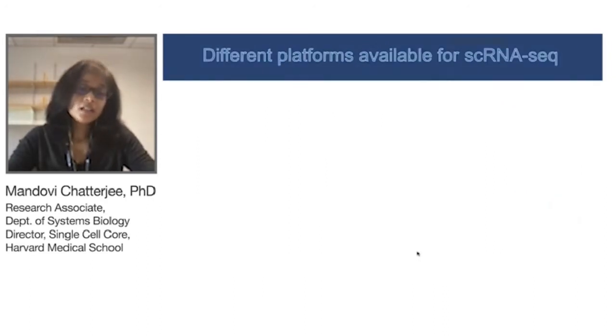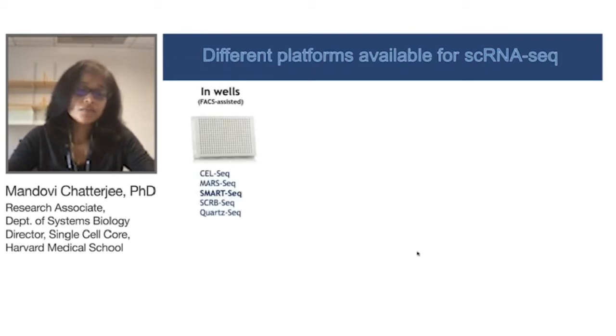In the last 10 years, the field has progressed significantly, and there are different single-cell platforms and technologies available now. Here are a few of them. The well-based methods such as SmartSeq are low throughput and labor-intensive, but full-length transcript can be studied using these platforms.